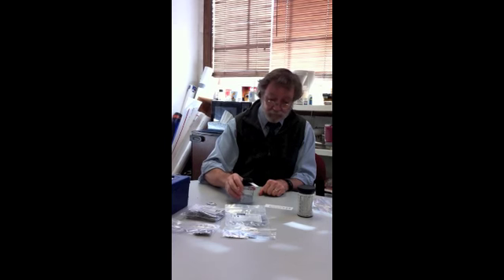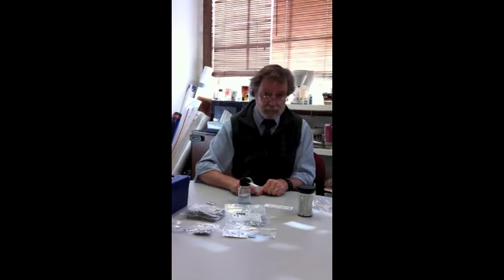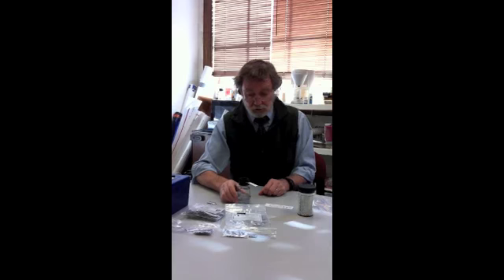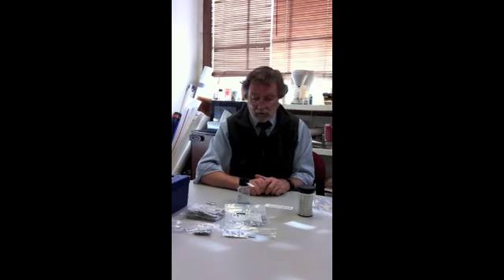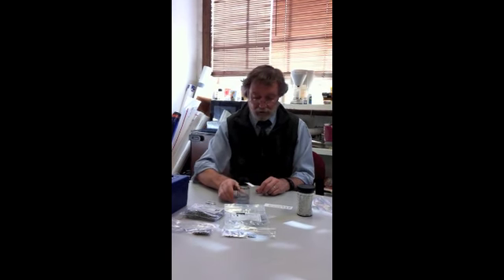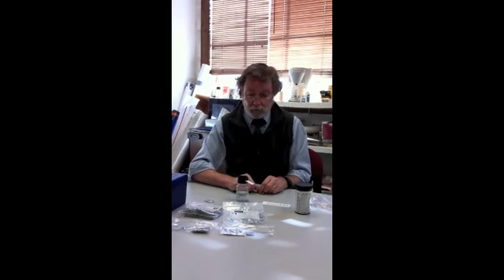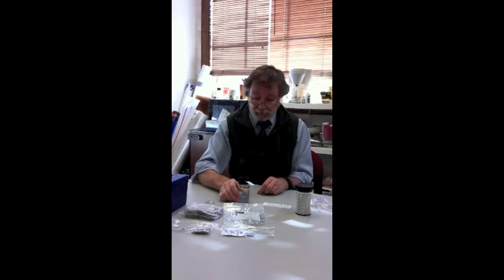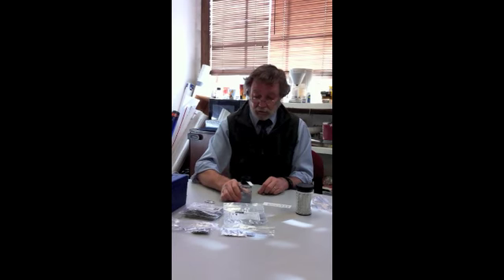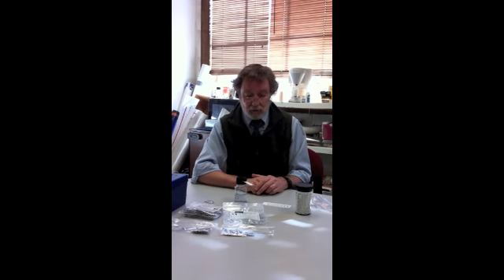And then from now on we require you just to swirl the solution gently. If you can, we prefer that you swirl this continuously for the measurement period. But if you can't manage to do that, then please try to do this as often as you can. And it's also very important that you don't splash the solution onto the test strip, as that will spoil the measurement and you won't get a satisfactory result. So just swirl this as often as you can for the remainder of the 40-minute period.